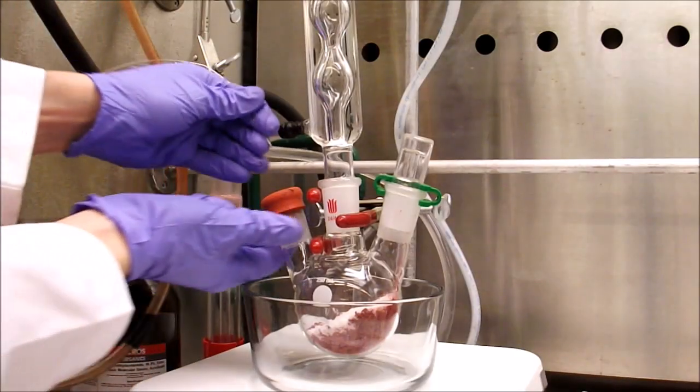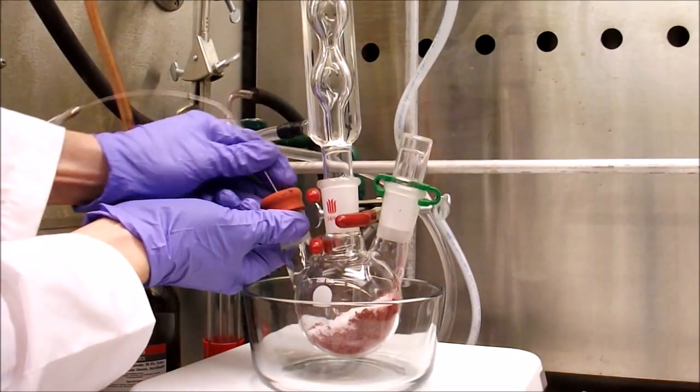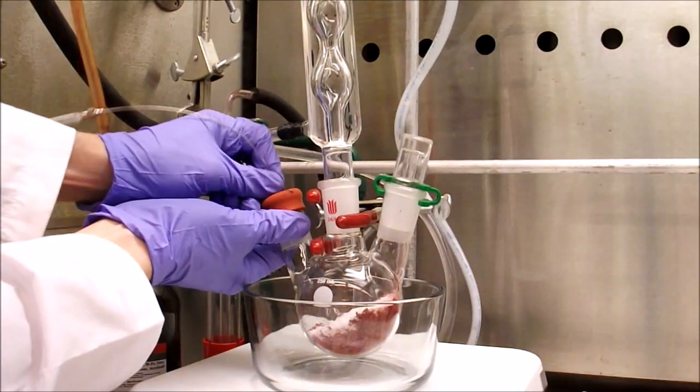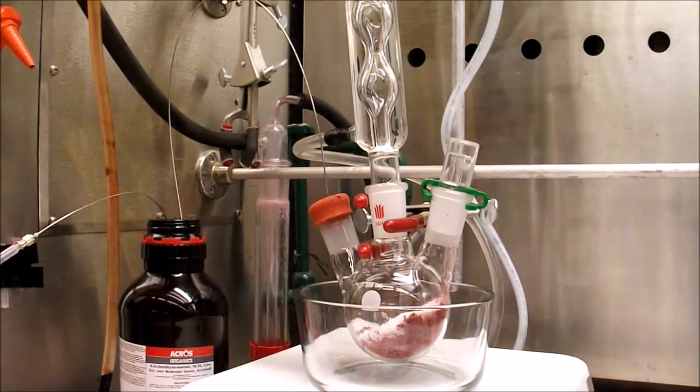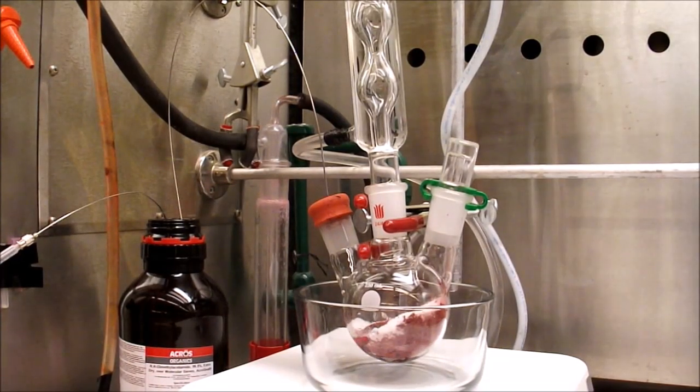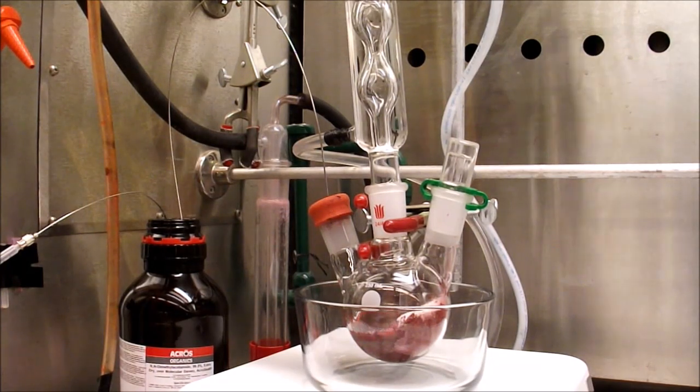Next the reaction is stoppered and purged with nitrogen for 10 minutes. It isn't in the shot, but there is a vent needle in the septa on the top of the reflux condenser. After the solids have been thoroughly purged, dried dimethylacetamide is added via cannula transfer to half fill the flask.